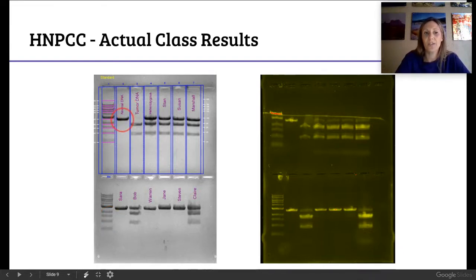So there was a control sample of normal DNA. There's our one band, like we discussed. Then there was a control tumor DNA where it was digested, so we have our 2 bands there. The kit also gives you a control heterozygous, so you see your 3 bands there.